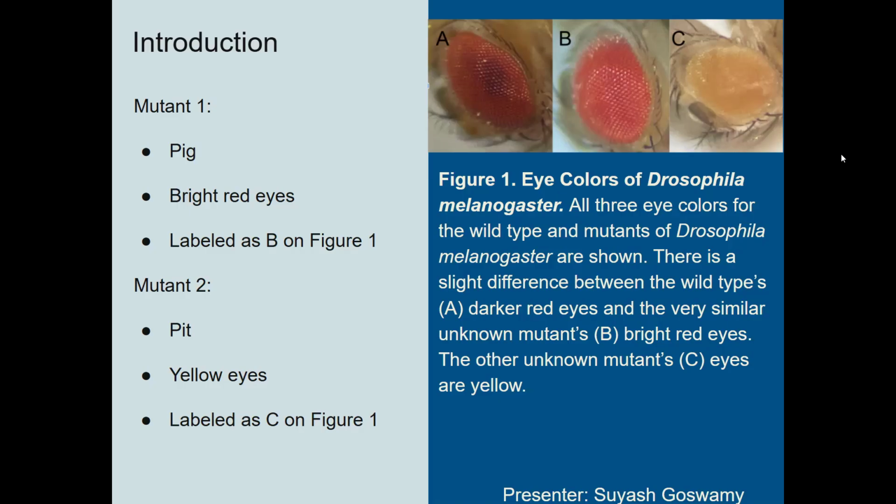These visual differences were crucial for tracking phenotypes across generations and determining if each mutation was likely X-linked or autosomal, which we will further explore in the results and mapping slides to follow.